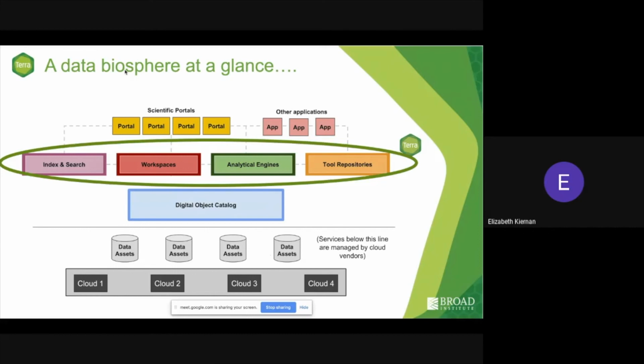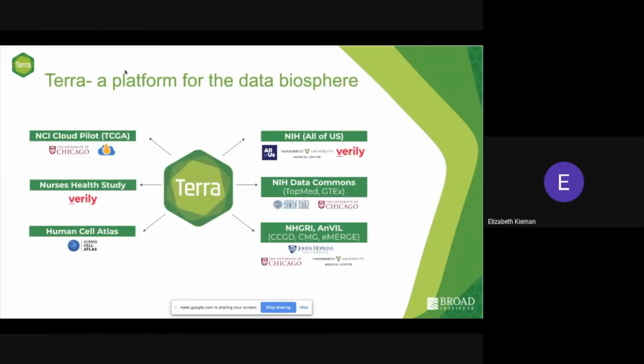And that's what today's webinar is really about, showing you around the Terra user interface so that you can see how exactly you can be connected to all of these data assets and how you can make the most use of them. So just to give you an idea of what types of data assets Terra gives you access to, here's a list of some of the data sets that you can access through Terra, as well as the institutions that are responsible for those data sets.